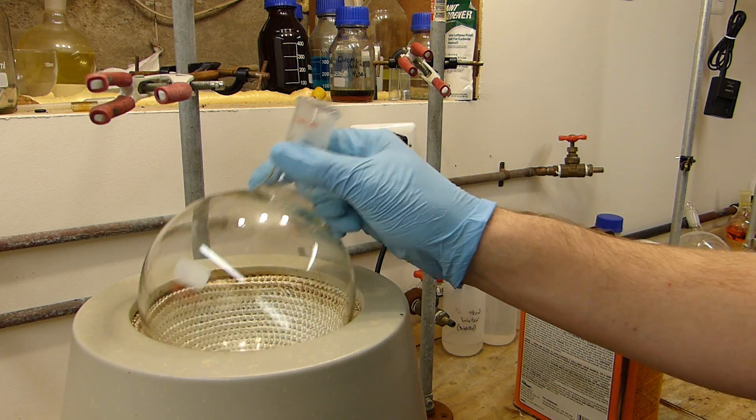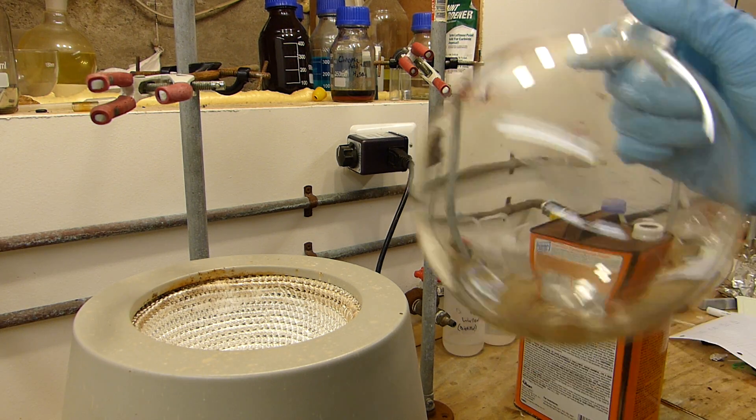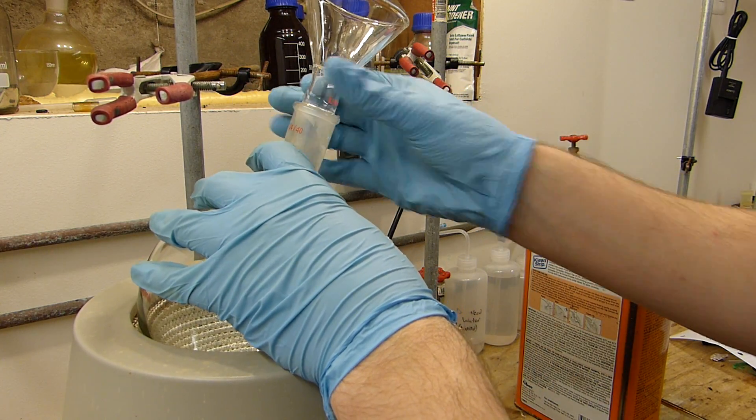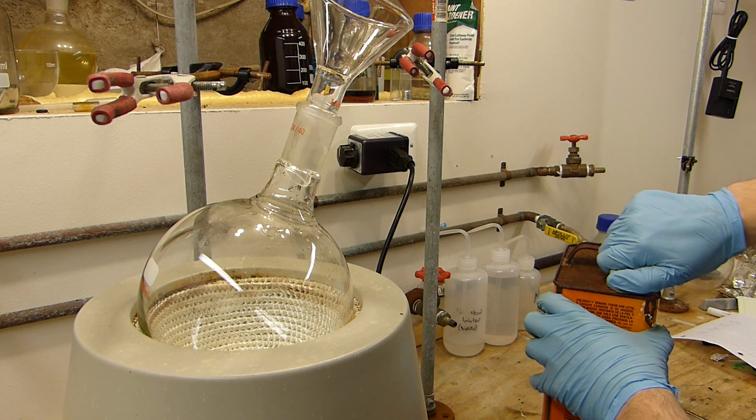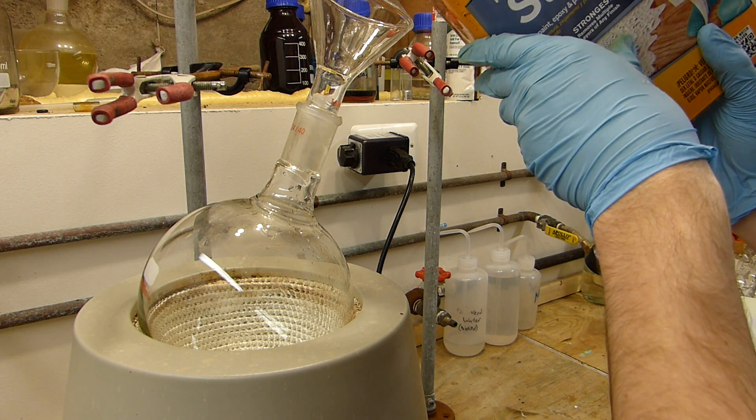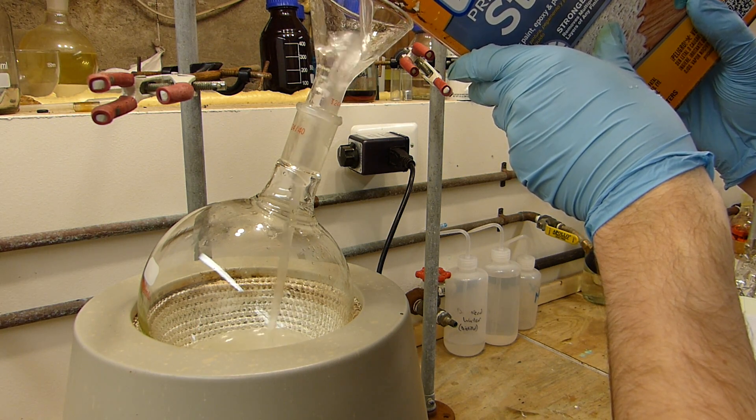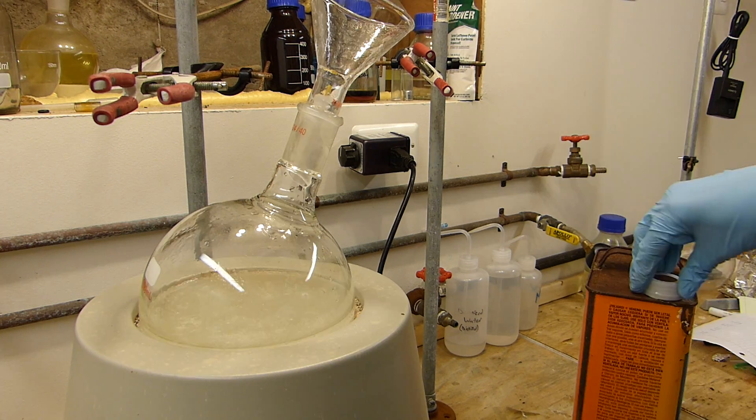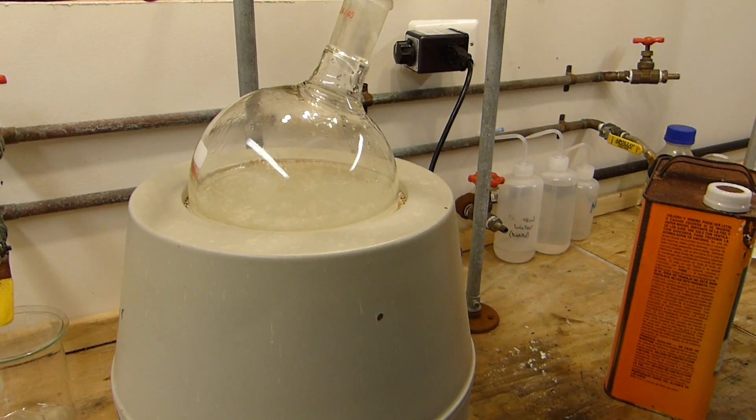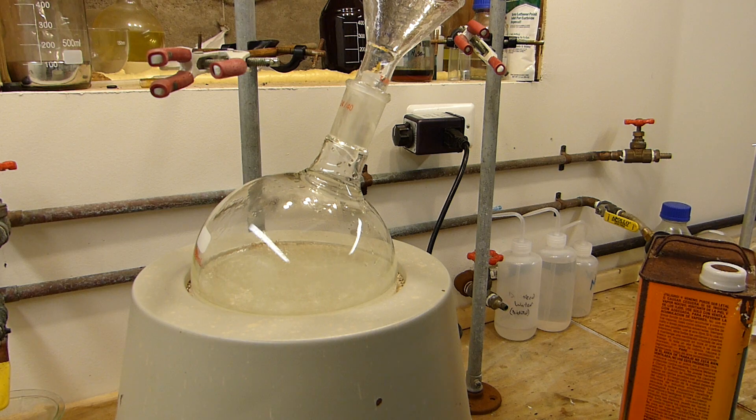All right, so the first step will be to load a bunch of the paint stripper into this flask. It's still a little wet from washing but that's not going to make a difference. I've got a one liter flask and my heating mantle here and I'll pour in some of this lovely gloopy paint stripper. You can see the flask is about half full with dichloromethane containing goop, polymer and crap, and I'll set this up for simple distillation.